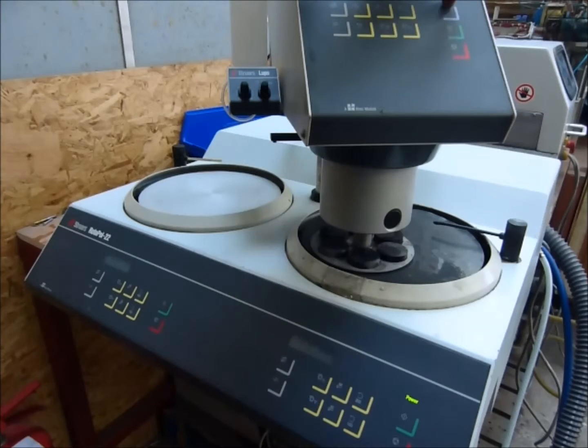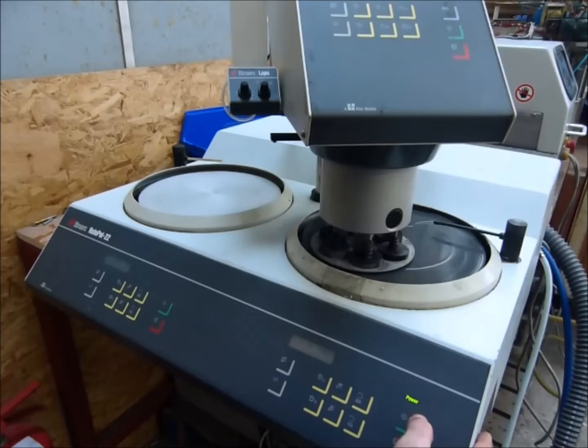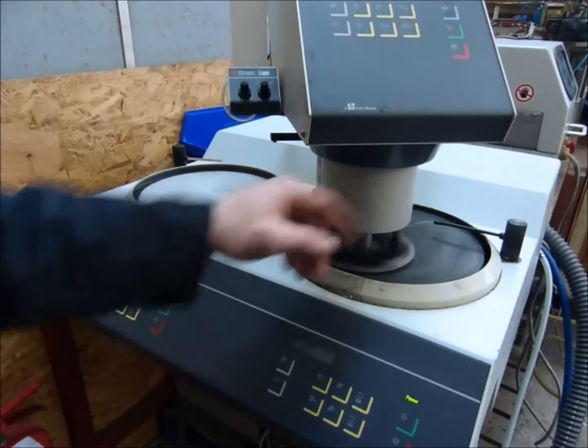Once set in auto mode, push the auto button and then hit start at the base. That automatically turns the water on.